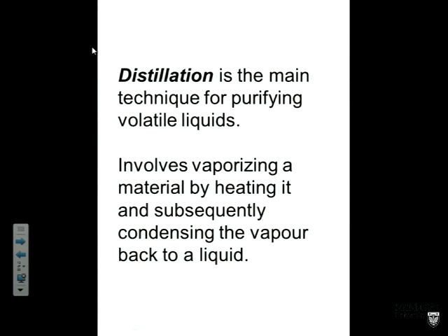Okay. So we've now managed to separate out, for example, our compound into the dichloromethane layer. Now we need to remove the dichloromethane and maybe even separate the compounds that were soluble in the dichloromethane layer even more. And there are some classic techniques for doing this, which apply only in a few particular circumstances. And then there's chromatography, which applies to almost any separation, further separation of compounds.